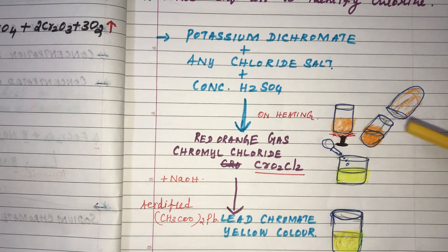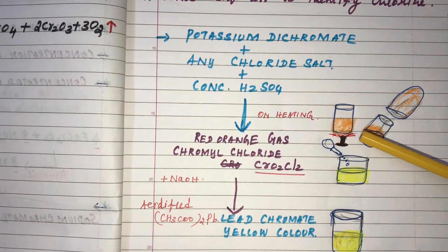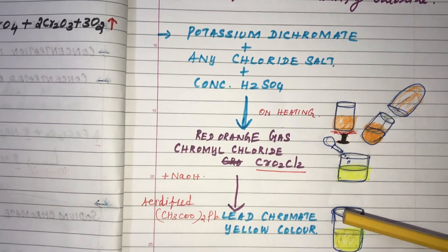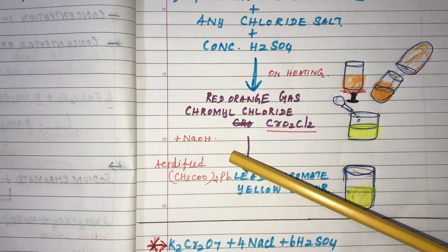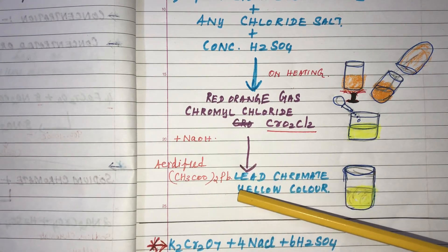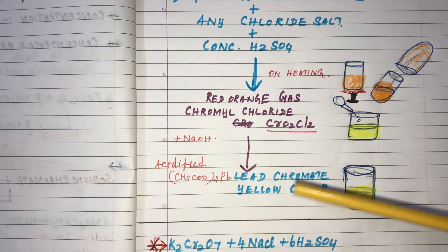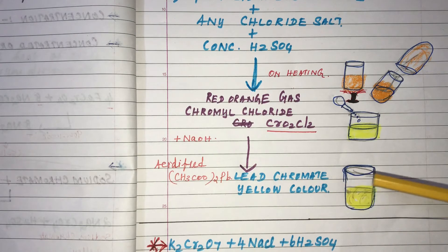The evolving vapours are collected in another test tube by keeping it in a slanting position. The red-orange vapours of Chromyl Chloride collected in the test tube are then treated by adding Sodium Hydroxide and acidified Lead Acetate. By the addition of Sodium Hydroxide and acidified Lead Acetate, the mixture forms a yellow-coloured Lead Chromate.